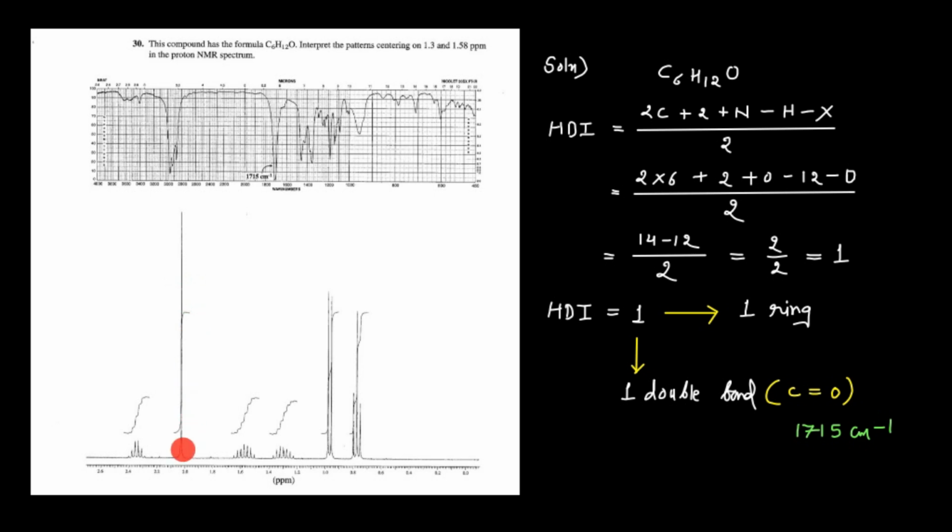It clearly indicates that it is connected with the carbonyl group, as its chemical shift also shows. So this fragment you have confirmed, CH3-C=O. Apart from this particular fragment, nothing much is there in the spectrum to give an idea about the other groups present in the molecule.